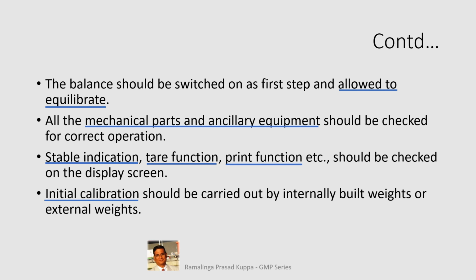Initial calibration should be carried out by internally built weights or external weights. Most of the sensitive analytical balances have built-in calibration. This can be reconfirmed by externally calibrated weights.